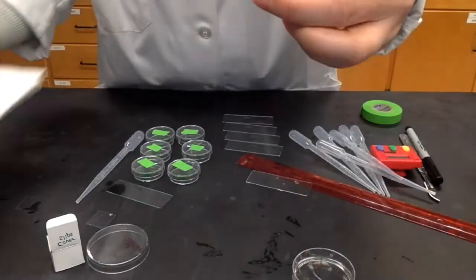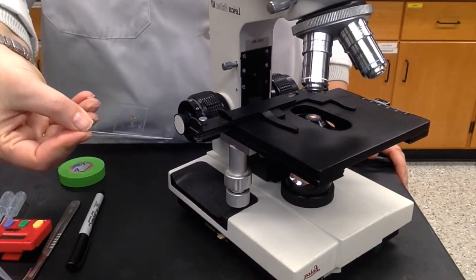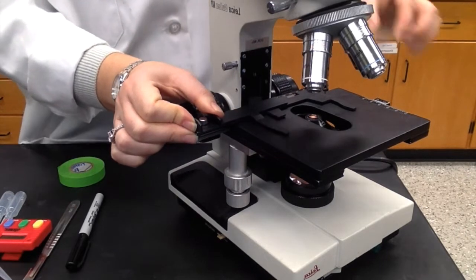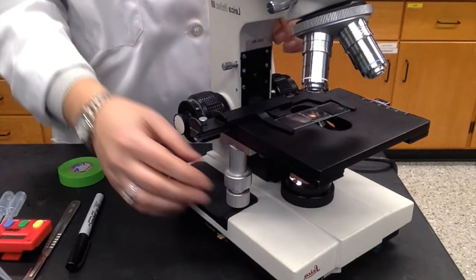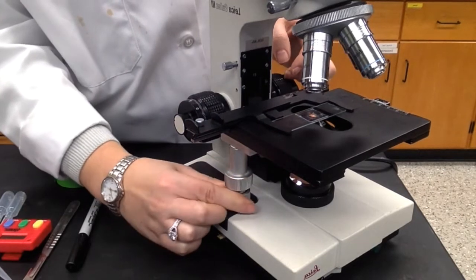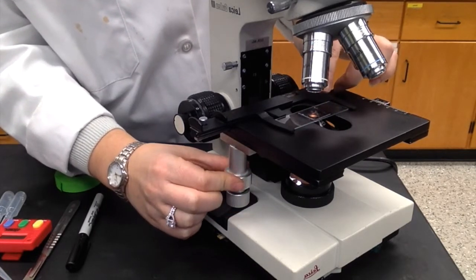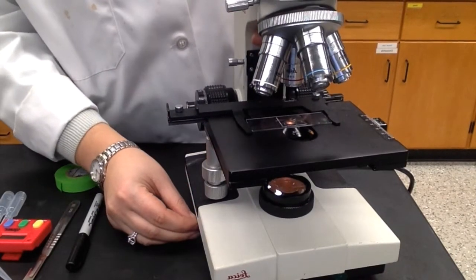At this point, you'll bring the slide to the microscope. Once you have your slide prepared with the worm underneath the cover slip, plug in your microscope and make sure the power strip is on. Use the slide stage clips to open and press close the slide on the stage. If you're off center for the stage clips, you can use these dials here to move the microscope stage clips until it is centered with the worm over the light source. Don't leave the light source on too long because you will cook the worm and can upset it.